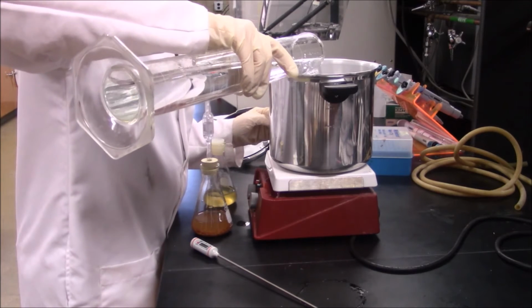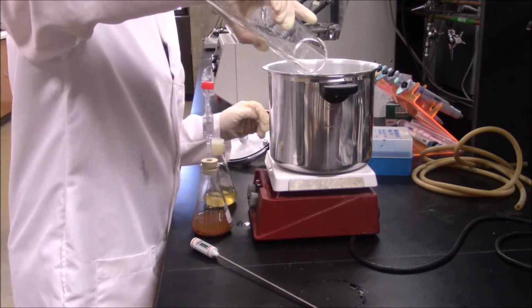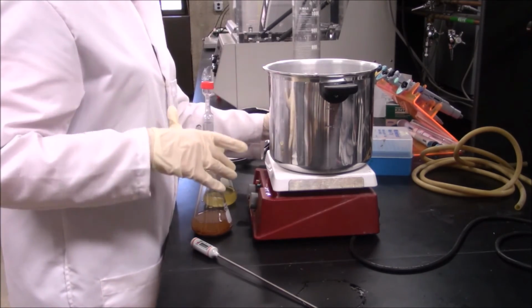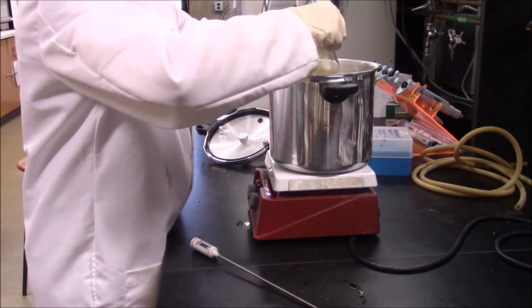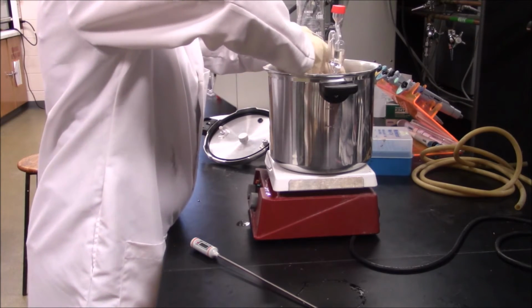Instead, simply turn the hot plate on low, place the pressure cooker on the hot plate, add 1 liter of water to the bottom of the pressure cooker, and place the flask in the pressure cooker. Use the thermometer to ensure that the environment remains at 35 degrees Celsius, adjusting the hot plate setting as necessary.